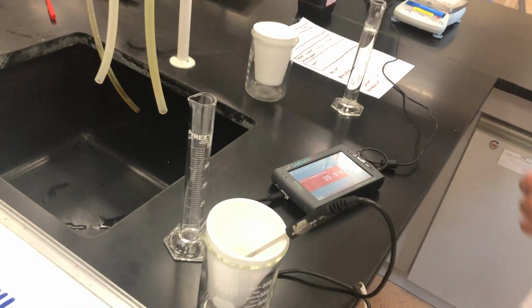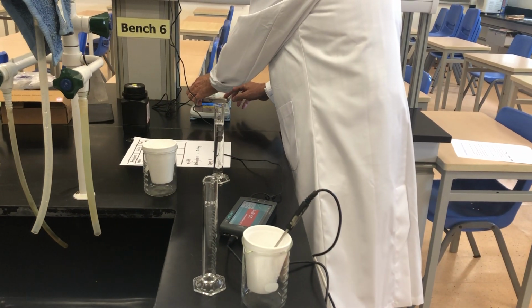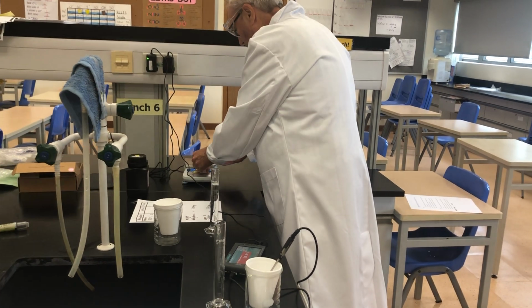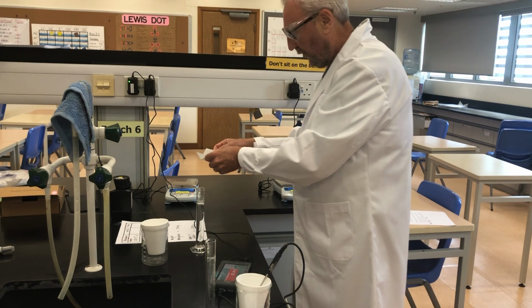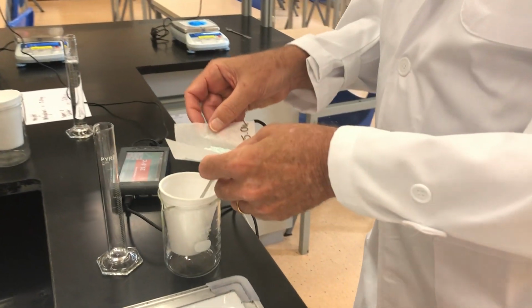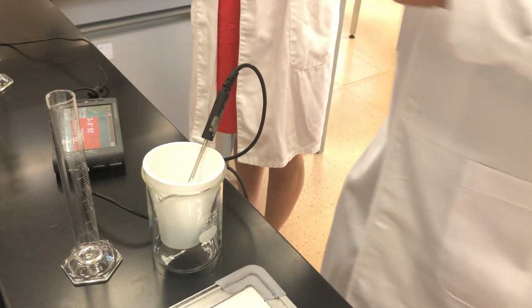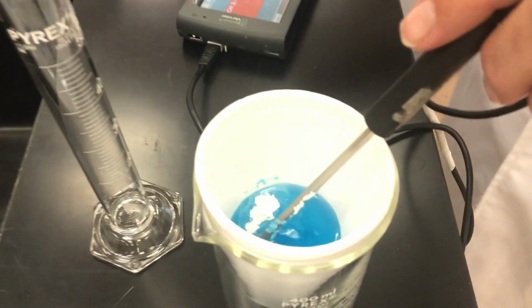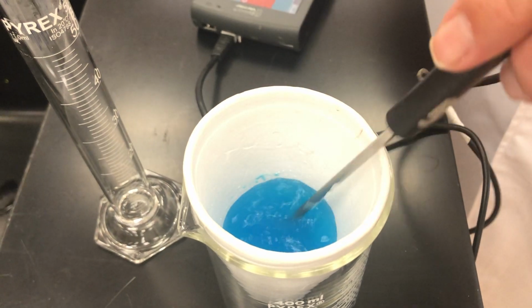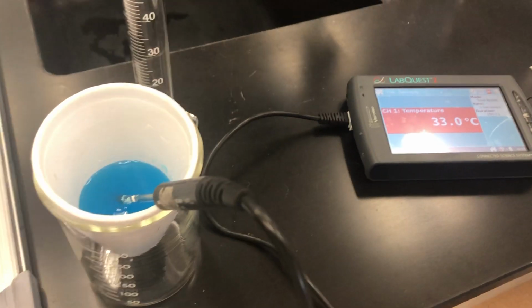25.9 degrees Celsius, and we're going to pop that down. And what we'll do now is add the anhydrous salt, because we know the mass of the salt. Notice it's white, but when we add it in here, you're going to see that it instantaneously turns blue because it's formed the hydrated salt. And we will measure it, stir it, and you'll see that the temperature is rising because it's an exothermic reaction.